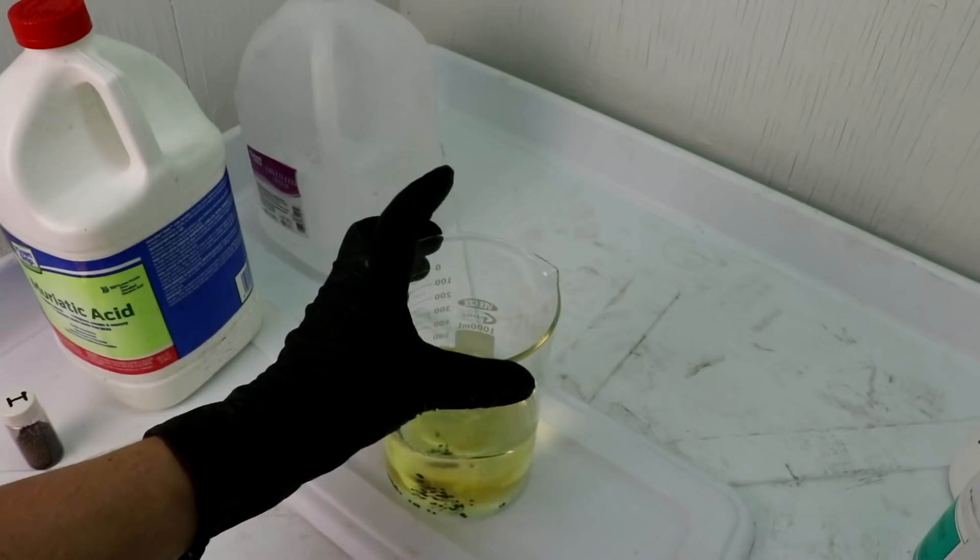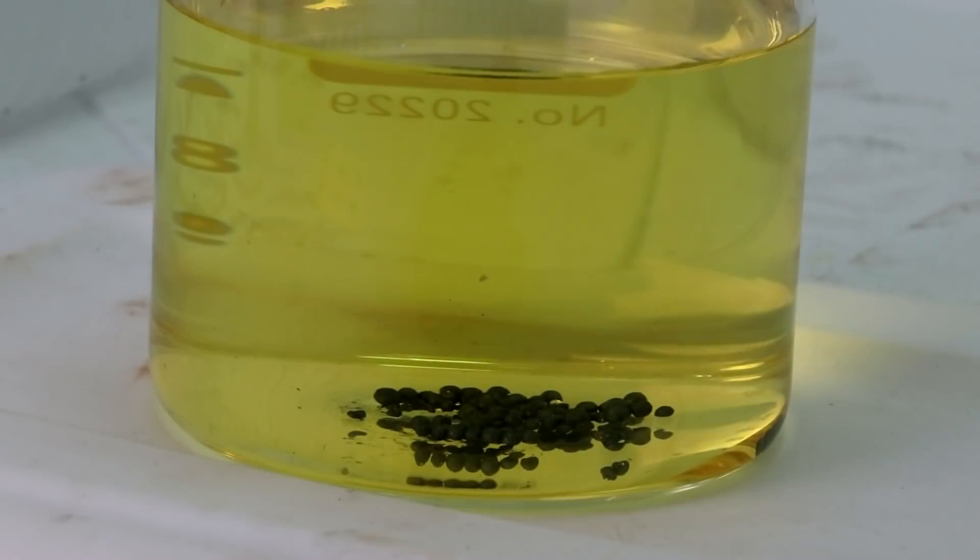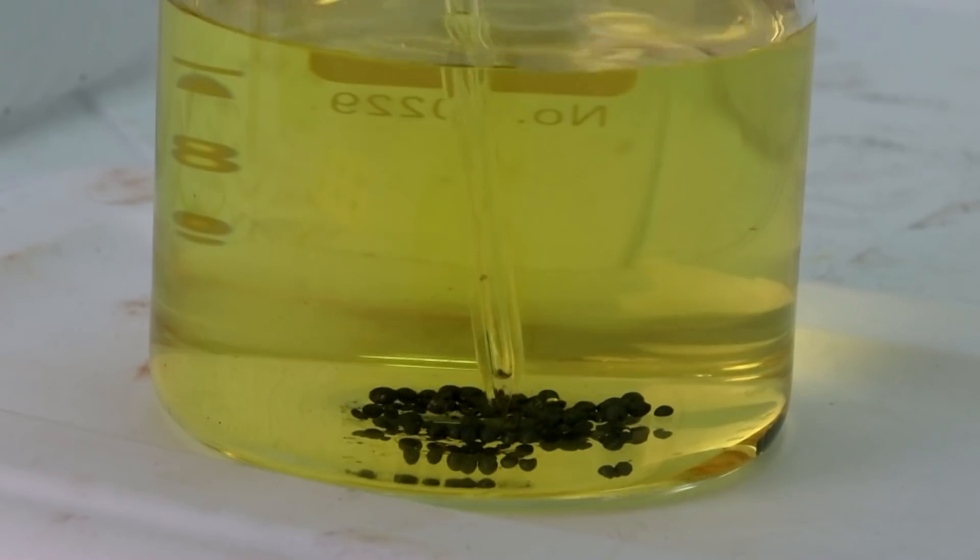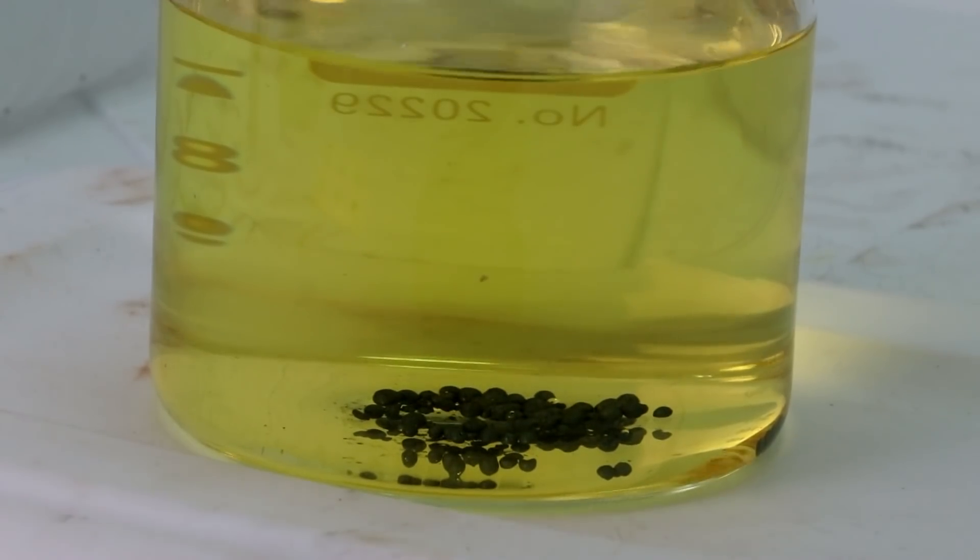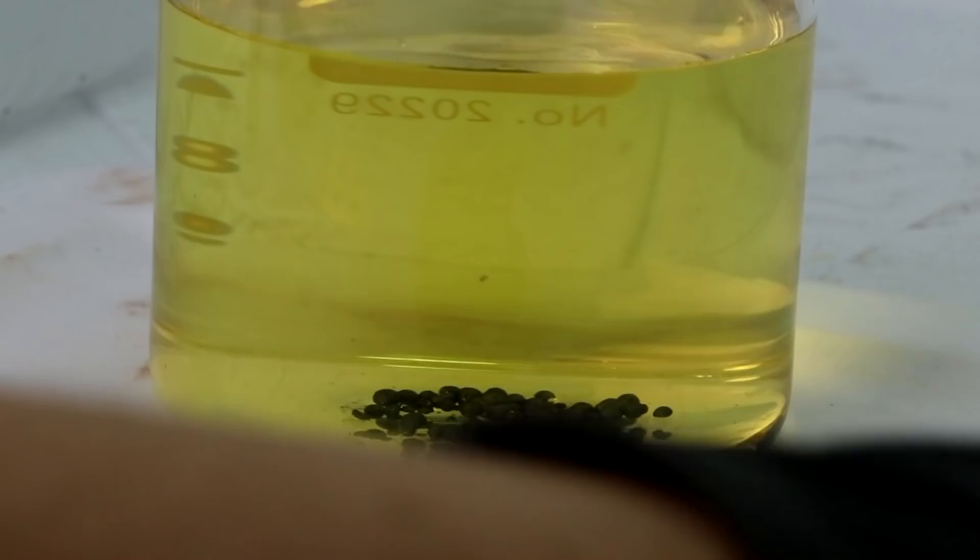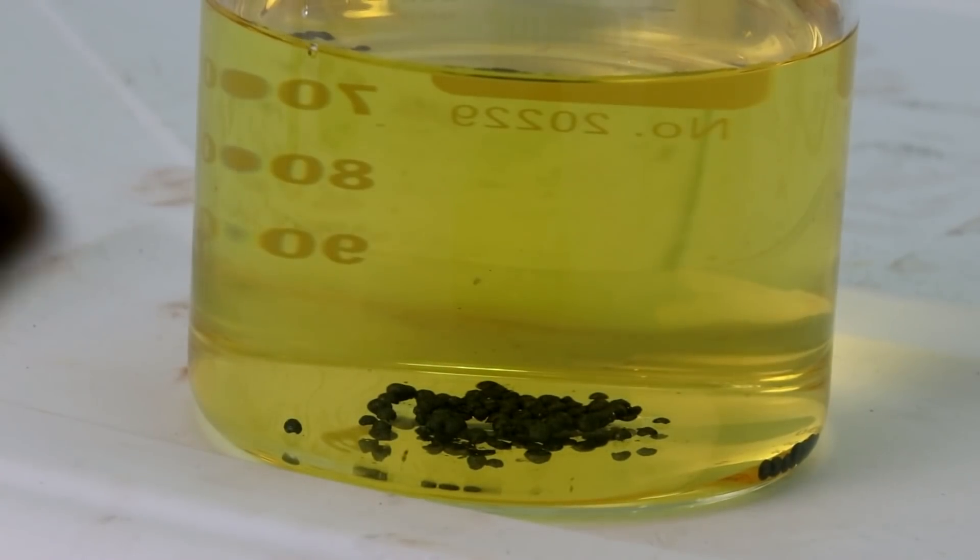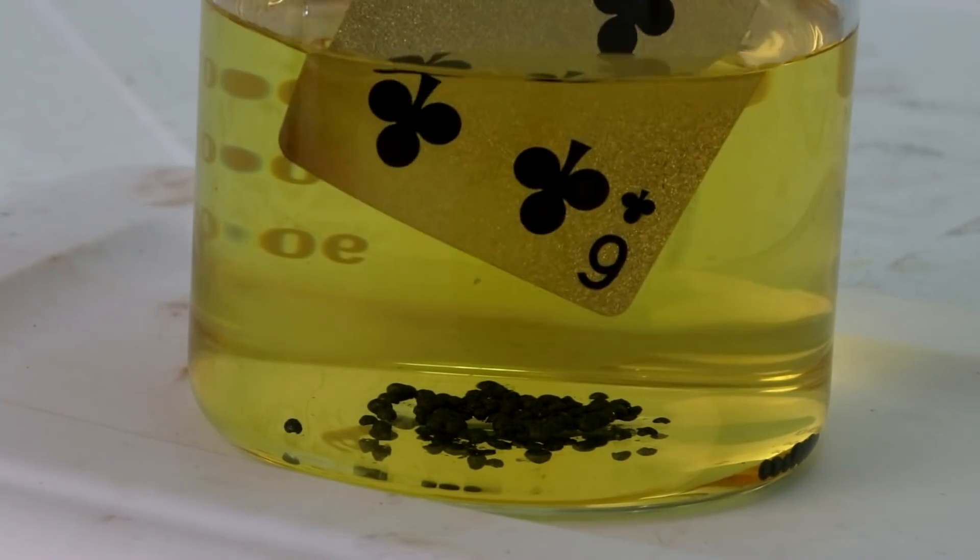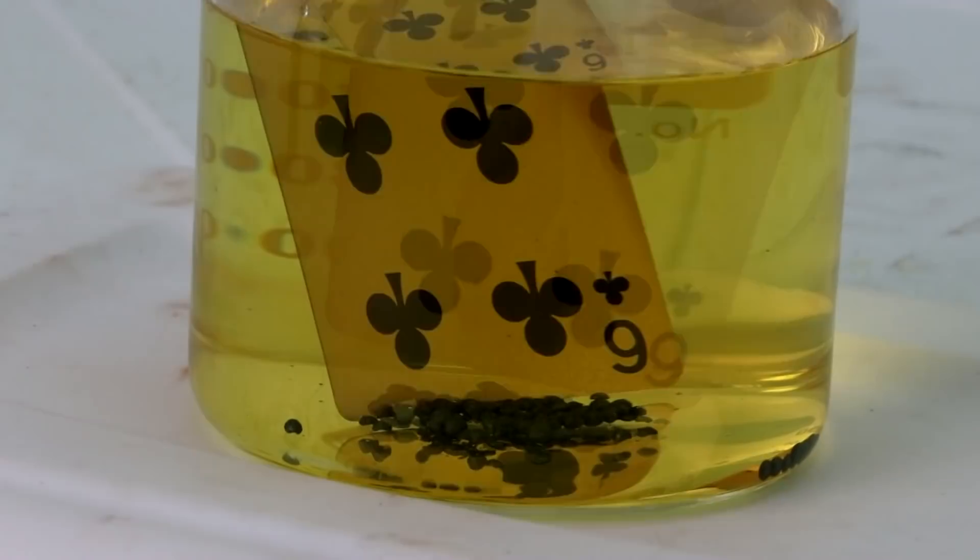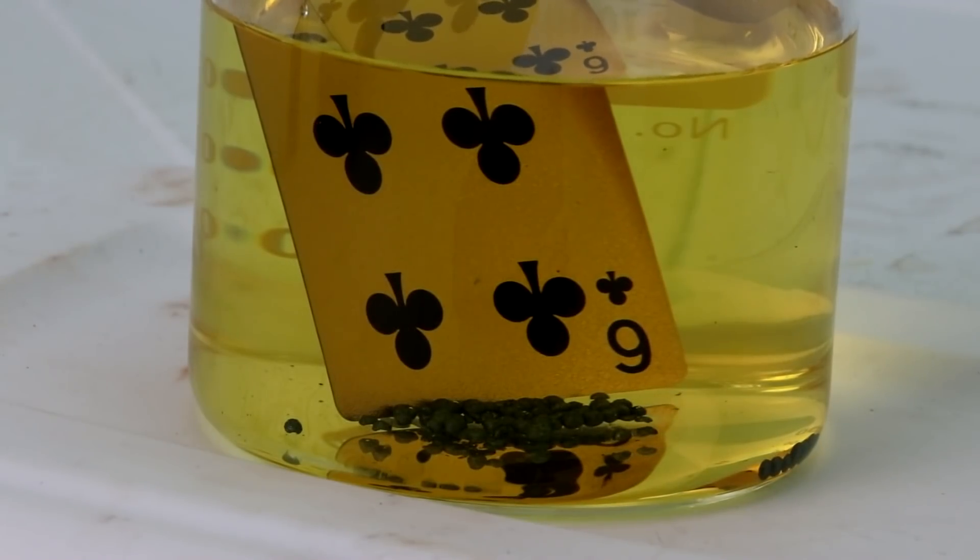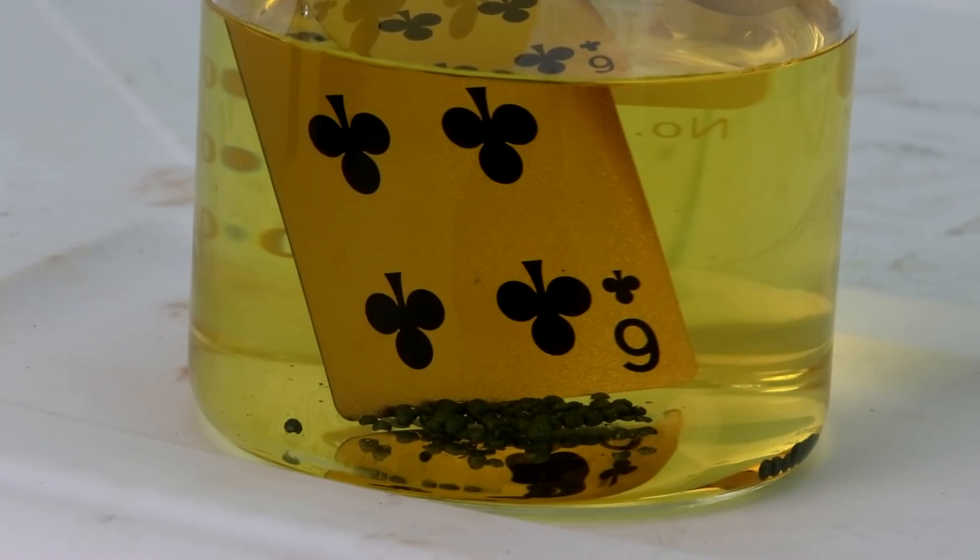There we go. Might need to get a stir rod to stir that up. Looks like it'll take a little while for the iodine to dissolve because it's in solid prills. It shouldn't really matter too much. Okay, let's take one of these cards and stick it in here and see if it'll actually work to dissolve the gold off of it. All right, I'm going to leave it like that for a little while. I'm actually going to go run down to the store. I've got a time-lapse camera going so see you guys in a bit.